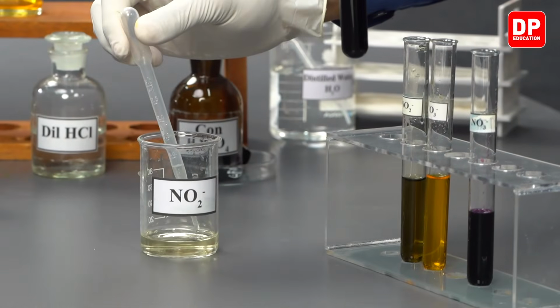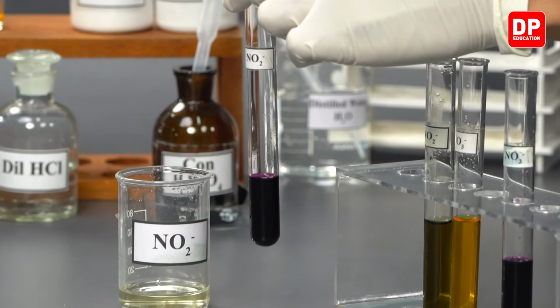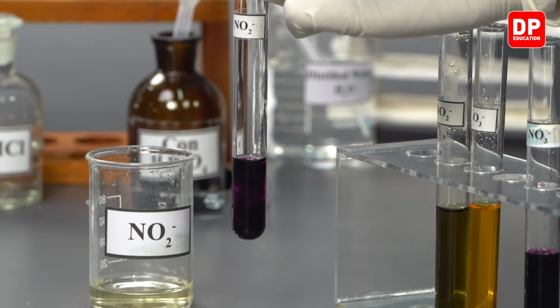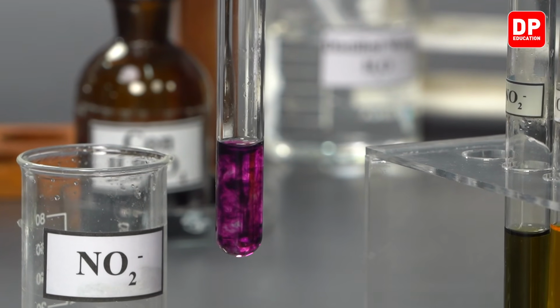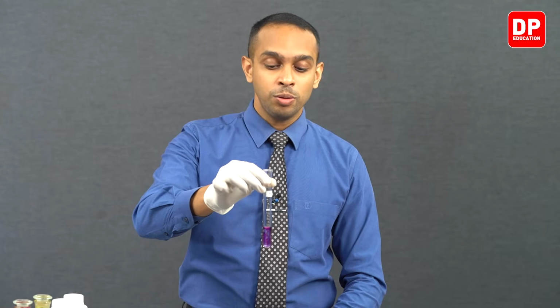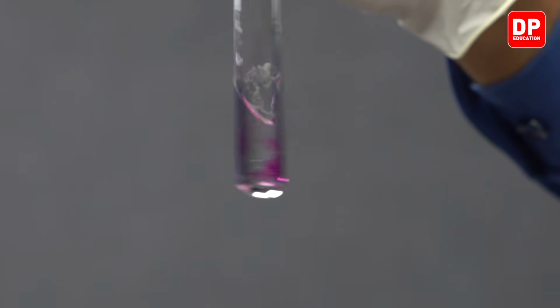Now let's move on to our acidified potassium permanganate solution that we have here. To that, we can add a small volume of nitrite ion solution. You can see as we add nitrite ions, the color of the solution changes gradually and turns colorless. It's very clearly seen here. Now, if I mix this solution, you can very clearly observe the solution turning colorless.